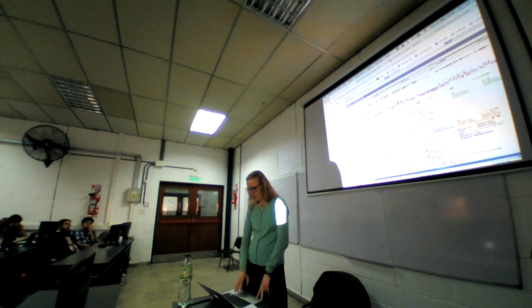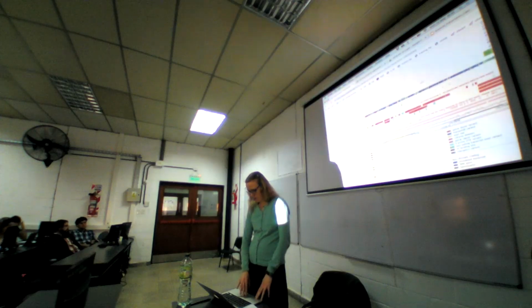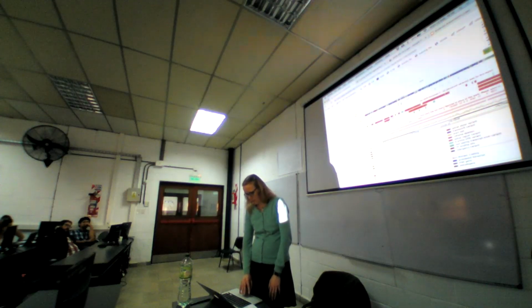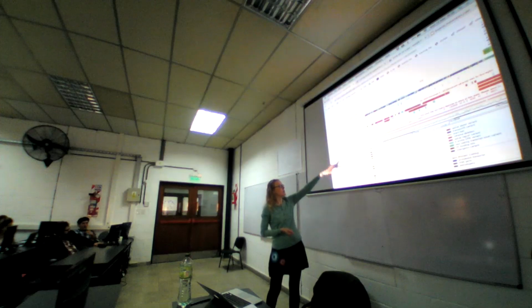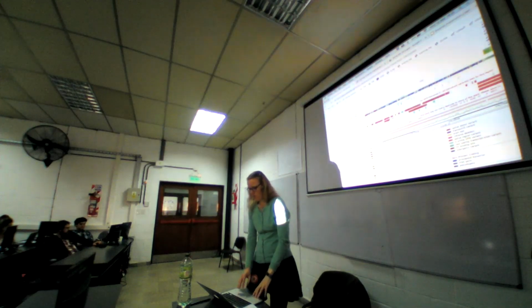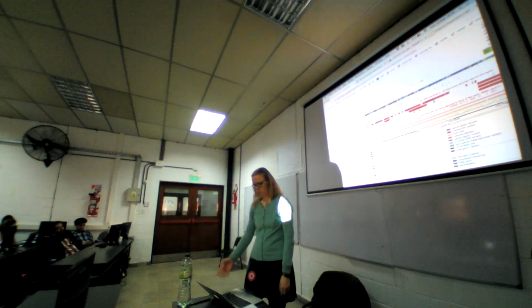Okay, so these are the conserved regions, and then I added alignment tracks as well, which are shown at the bottom of the page. Again in pink. I'm not sure why all of this is in pink. So here, a pink bar represents an alignment of that species with human, and white is no alignment. And you can see that, of course, for closely related species, chimpanzee and human, who have more alignment than for, say, chicken and human.